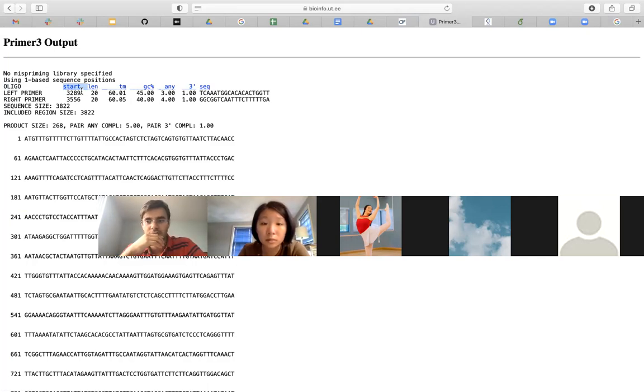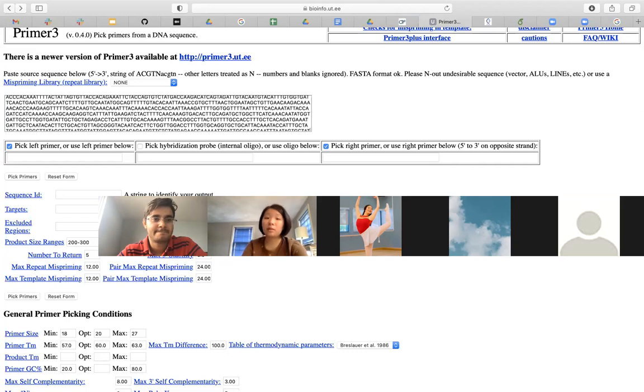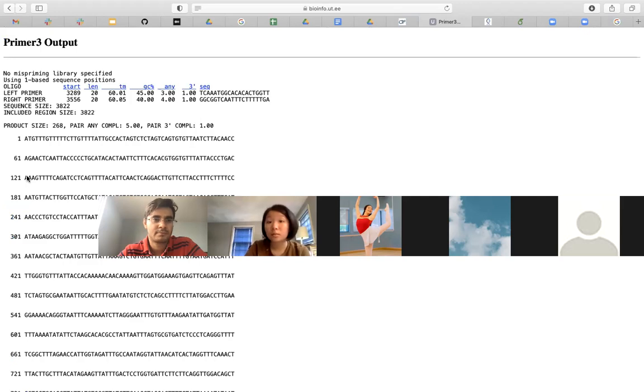Wait, Gio, how did you get here? How did I get here? Like to this website. Oh, you select pick primers. Yes, the button. Oh, okay. Pick primers. I am picking the primers, correct?